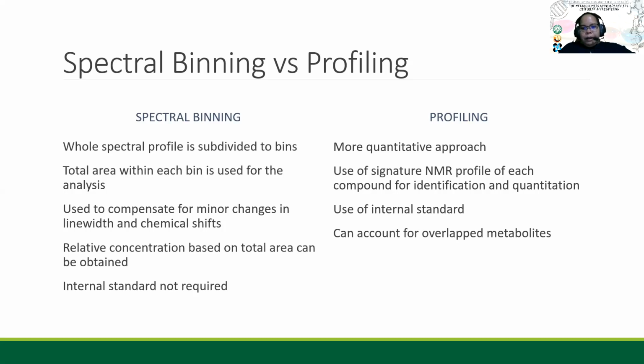One problem, as mentioned in our previous session where we talked about the advantages and disadvantages of the different instruments: in NMR, if you have compounds that are quite similar, having similar signals at a particular chemical shift region, then they will be highly overlapped in that region.